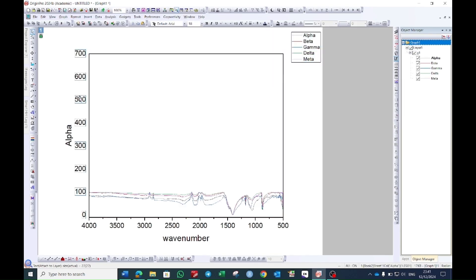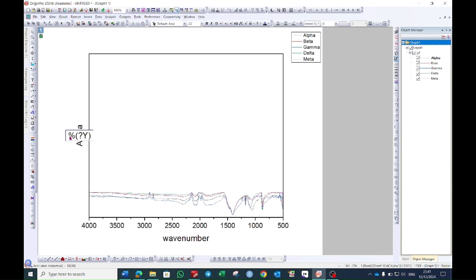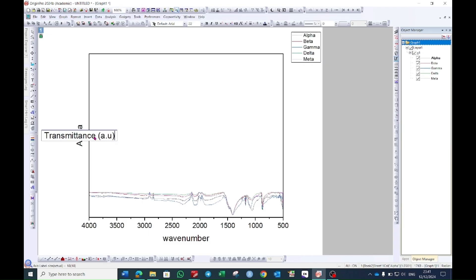Now select this y-axis value and then press delete from the keyboard. Now double select this y-axis and make it as transmittance or absorbance as per your data and make it as arbitrary unit a.u.